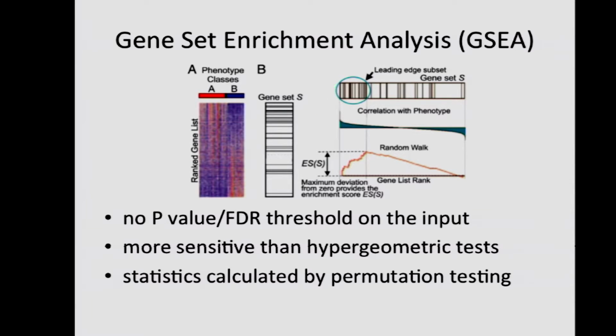And what it does is it starts with the first gene, and then the second gene, and the third gene, and it goes on. And at each step, it says, at that point, how much enrichment do I see? Okay? And so as I walk down the gene list, if there is enrichment, then this red line here will start to randomly bop up and down, and it will keep increasing and increasing until the enrichment stops. Right? So the rest of the gene set is essentially randomly distributed, so now the random walk drops back down to the bottom. There's no further enrichment. We call these things Virginia plots, and we like to see Virginia plots.